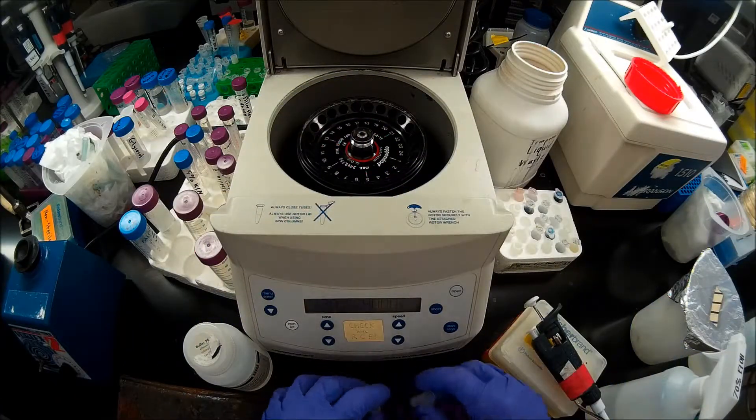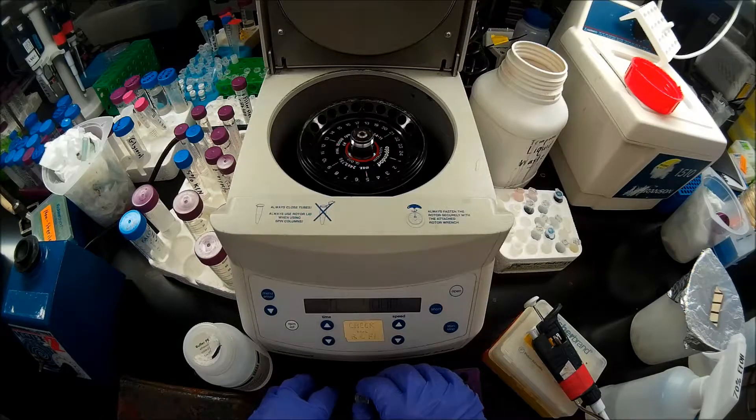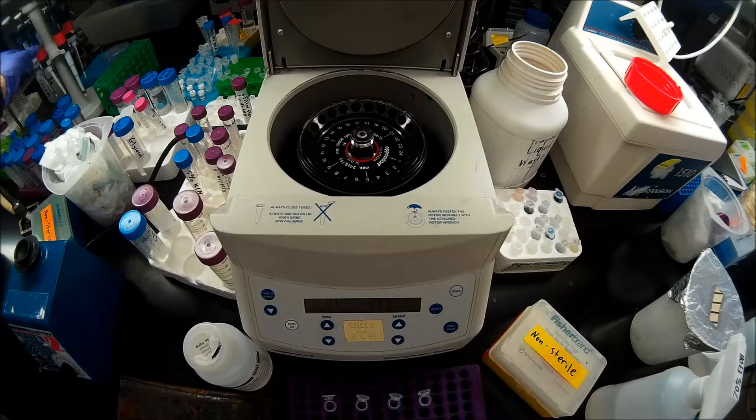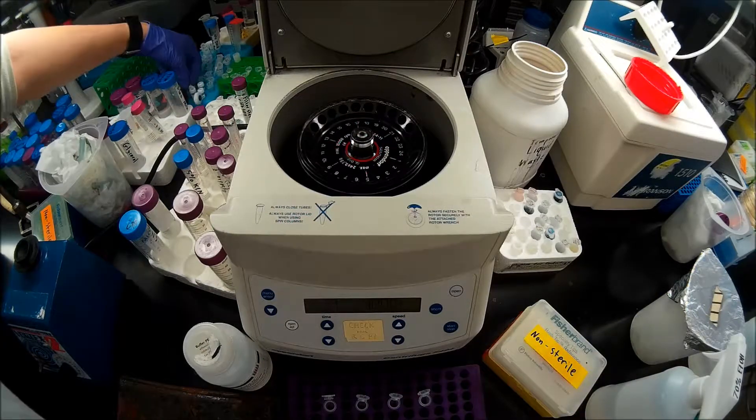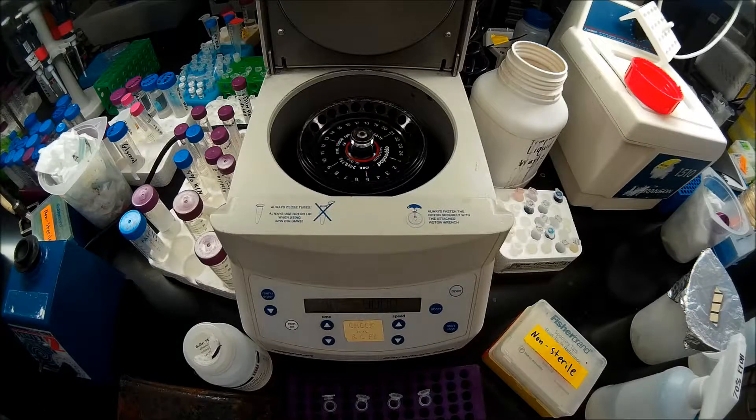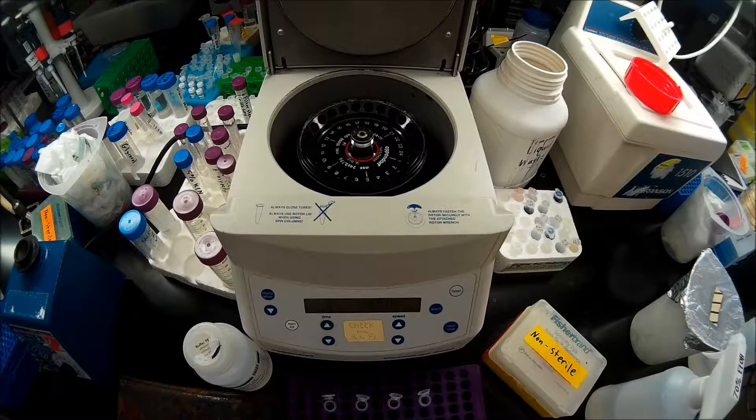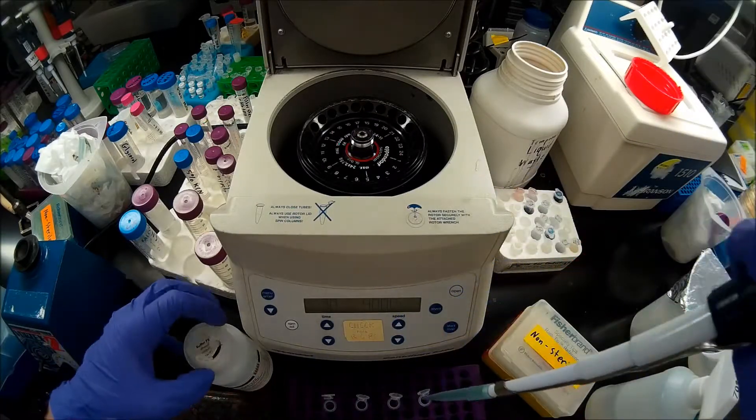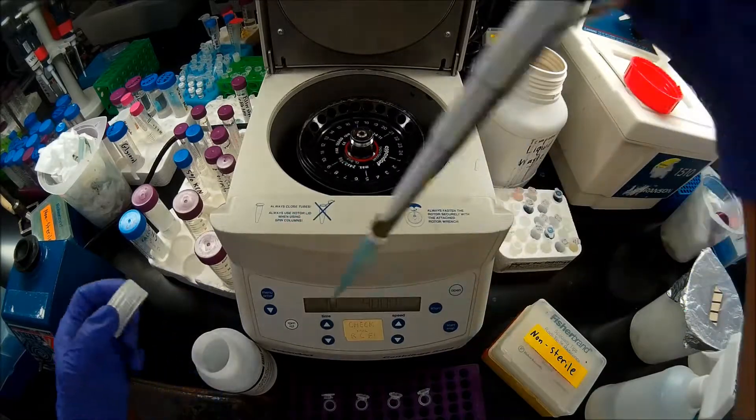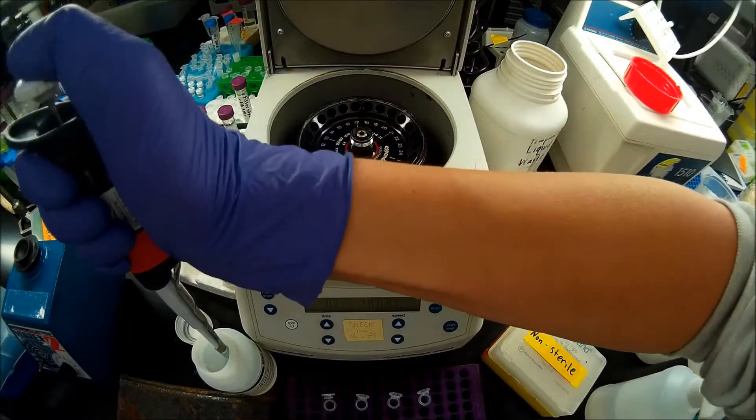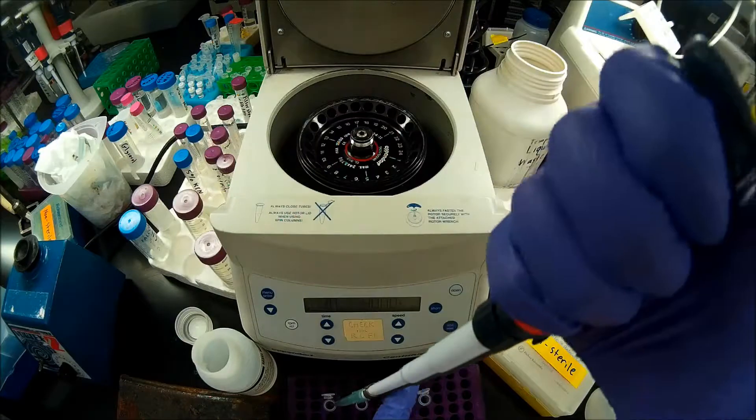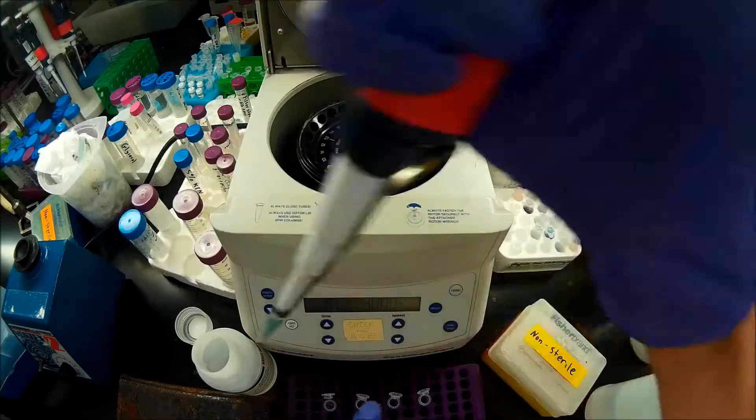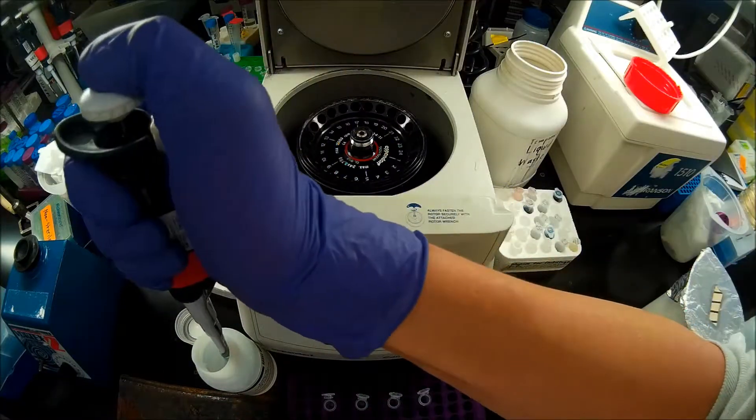Now I'm going to take my PE buffer, just as we would in a DNA cleanup, which again is pretty much what we're doing now. Take my P1000, wash with 750 microliters of PE. So I'm going to re-suspend those on my vortex mixer over here.